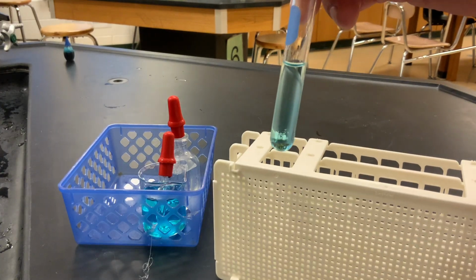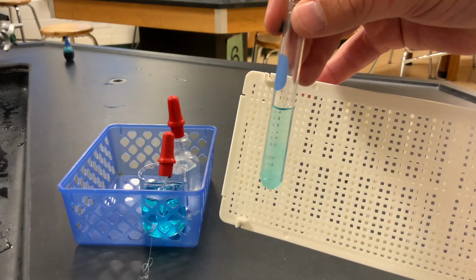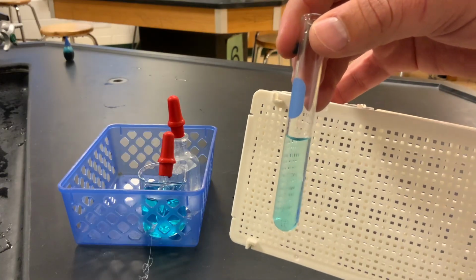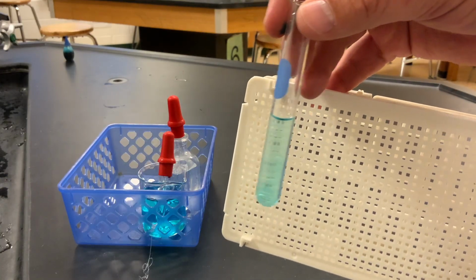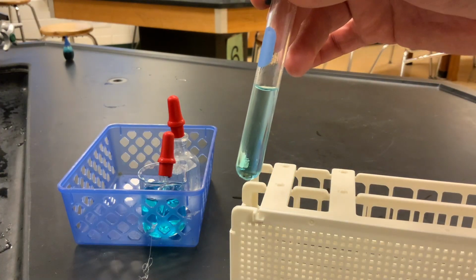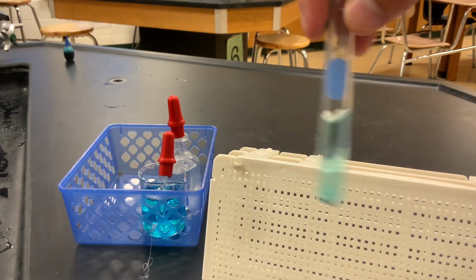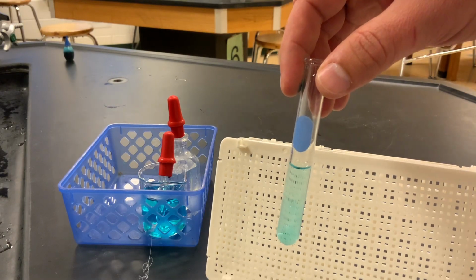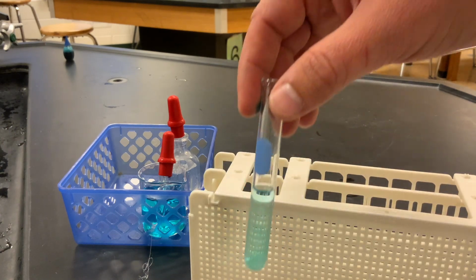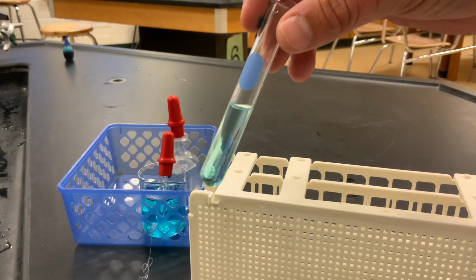And in this case, we see that it did, because if I look at that, it's a pretty consistent solution. There's no layering. That's one key thing we can look for, is whether it's layered. But we're not worried about how much it's mixing or dissolving, just that it did. And if we mix it up, we can see that there's no layering, and whether you hold your paper up to it doesn't really matter. We can also see that blue color throughout. That's what the water's meant to help us with. So that's what you're going to do.